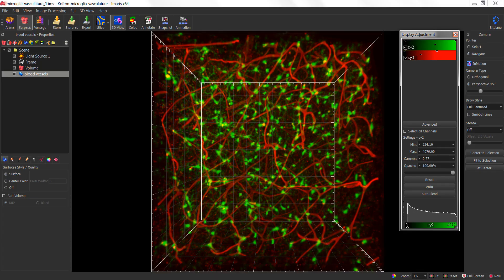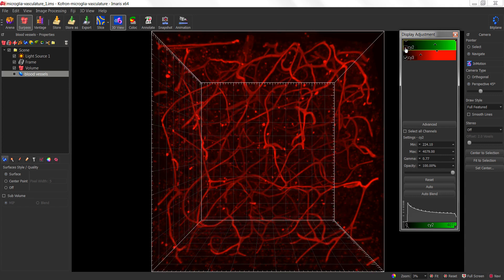For the purpose of this demonstration, I'm going to be using this two-photon data set. This is a 500 micron thick section of a mouse brain. The red, or Psi-3, is blood vasculature. The green, or Psi-2, is microglia. For the demonstration I'm about to do, I'm going to be focusing in on the Psi-3 channel, so I'm going to turn the Psi-2 channel off.